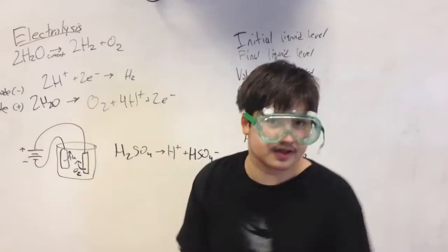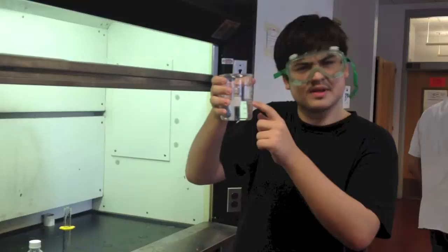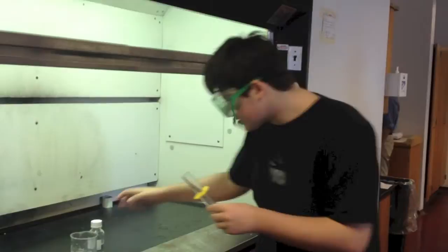In this lab, we're going to need a diluted solution of H2SO4. We're going to do that by taking 200 milliliters of water and getting this graduated cylinder and adding 10 milliliters of concentrated sulfuric acid, and then we're going to add it to here and thus diluting it.